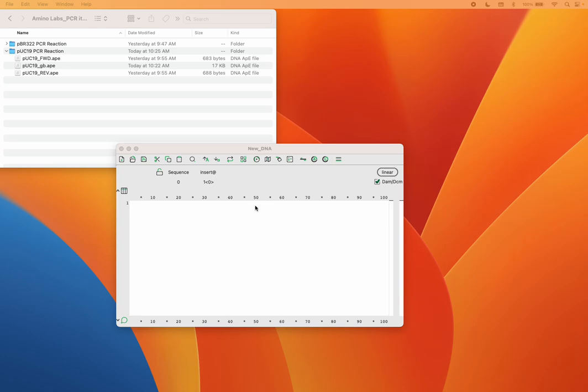And also you did an in silico agarose gel where you could see how, theoretically, if you successfully amplified that fragment, where it would run in a gel. So today we're going to continue forward with this topic. In the PCR-it Kit, you were given primer sequences and primers. In this tutorial, we're going to look at how those primers are actually designed and where they came from.